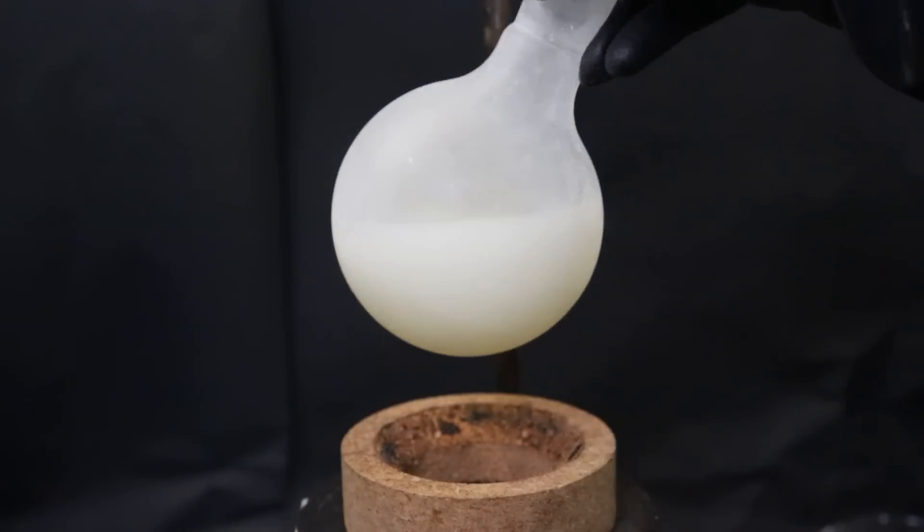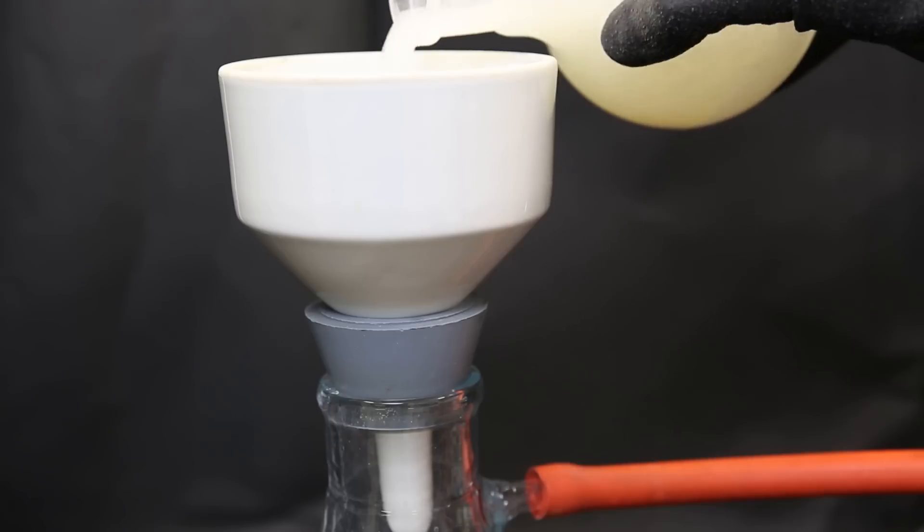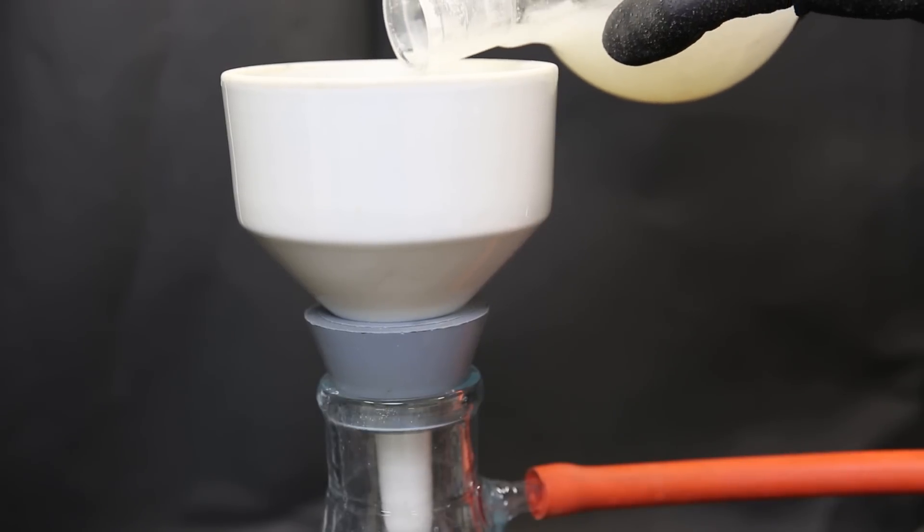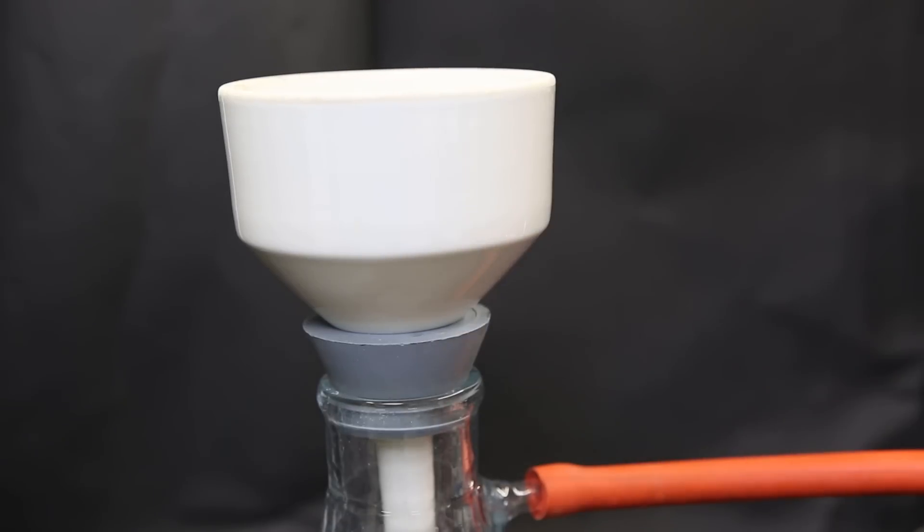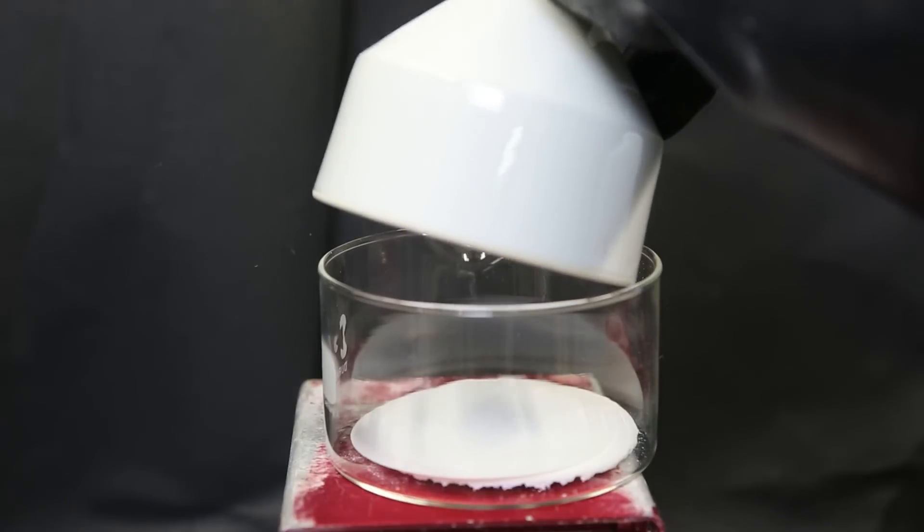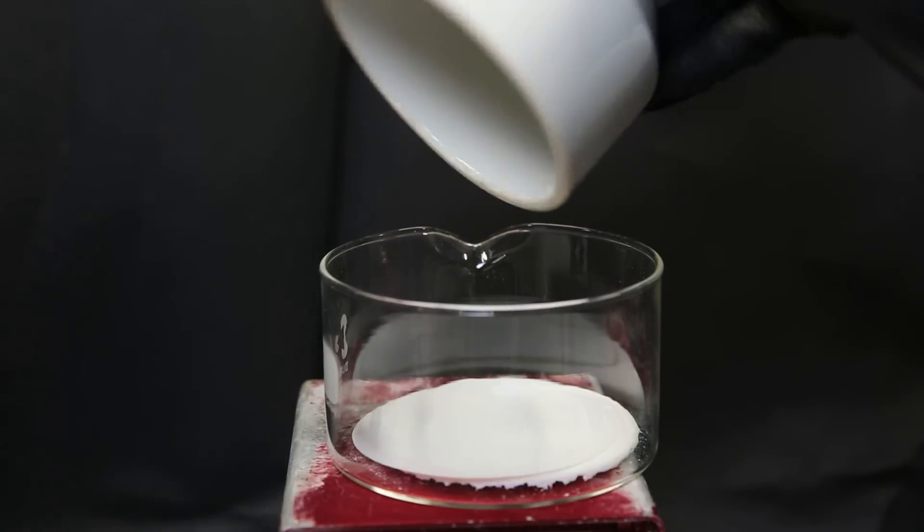So to collect the pure product, I set it up for vacuum filtration. I simply pour it all onto the filter and let it dry for about 15 minutes. Then I put it all into a dish, and we can see it is one big white piece, probably because it's still a little bit wet.